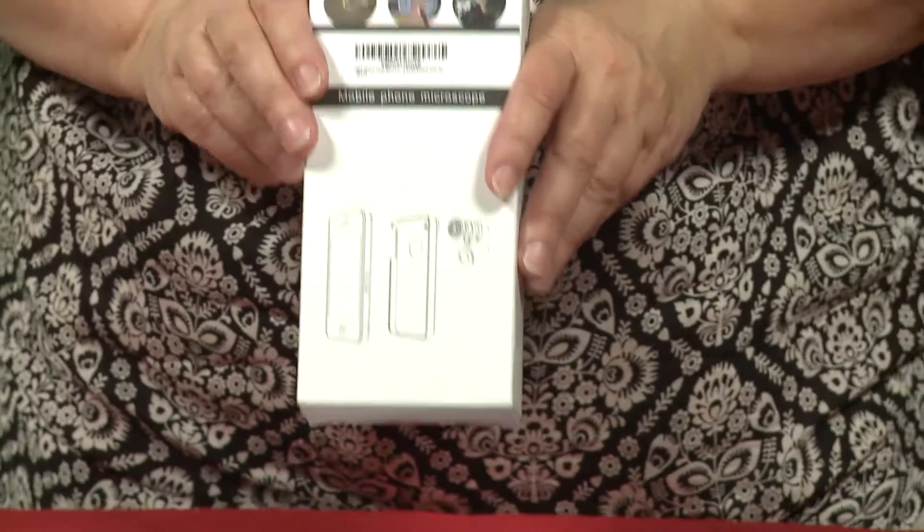These are the instructions for using the attachment to turn your cell phone into a microscope. It all comes in this small box. In the box, you will see these two attachments. You use whichever one fits your phone best. If neither of these fits your phone, then you can use this clip instead.